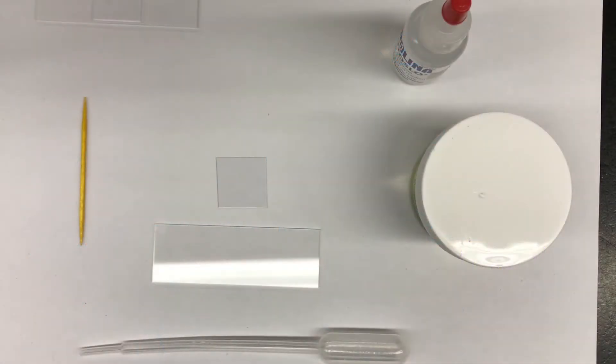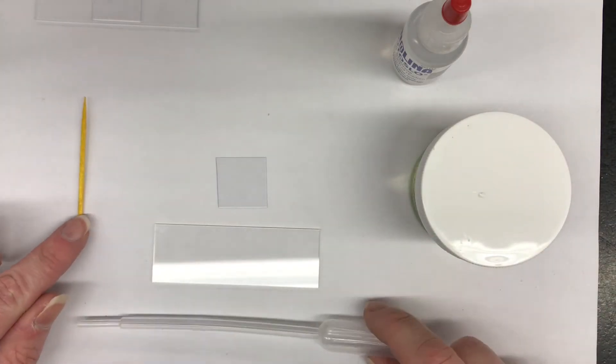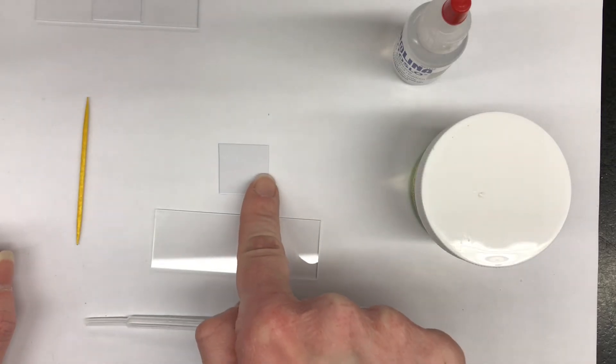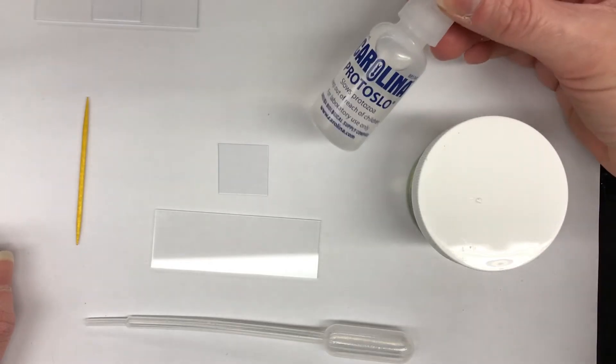Now we are going to make a wet mount slide for the euglena. We're going to start with our toothpick, our plastic pipette, our glass slide, cover slip, our specimen, and the protosloe.